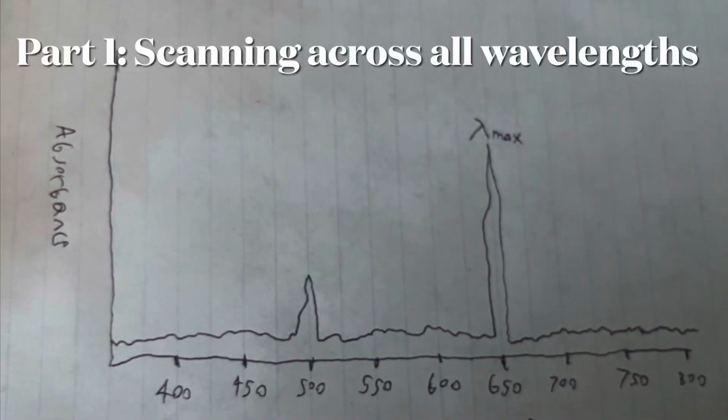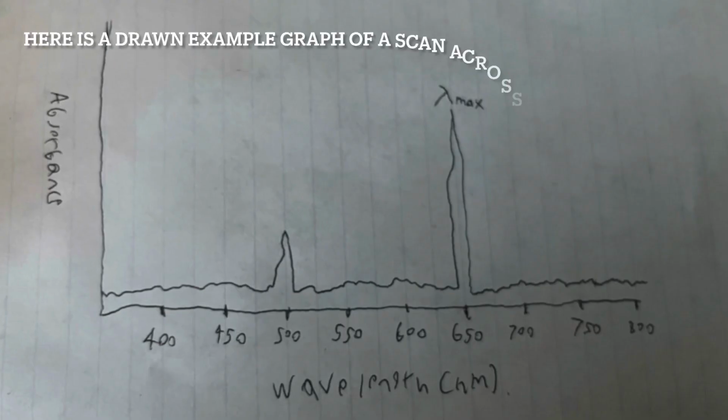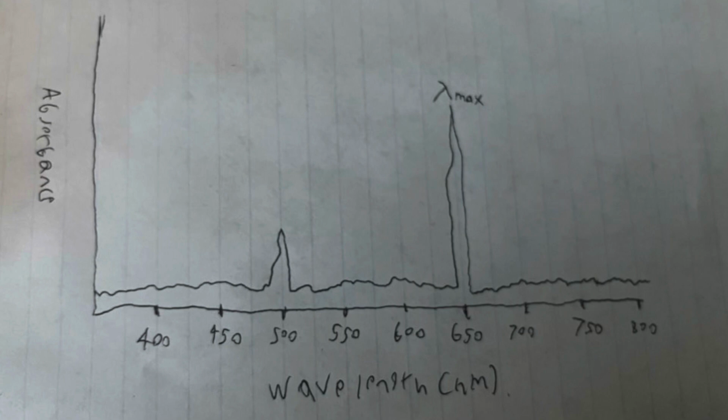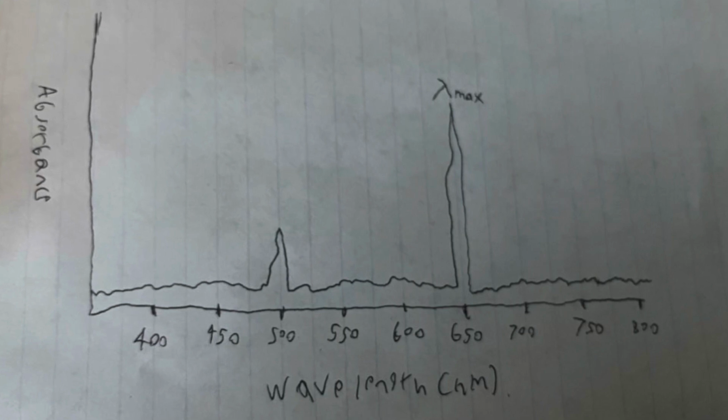When using a spectrophotometer, you would scan across all wavelengths of light in order to determine the best possible wavelength to find absorbance for the specific sample. This value is usually the lambda max. Additionally, when you scan across all wavelengths of light, you are identifying a solution.